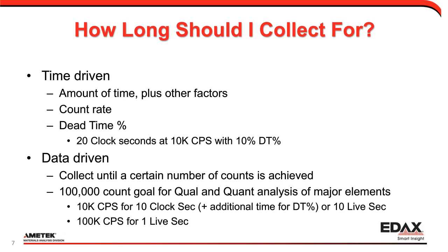One of the activities that we do in applications very frequently is work with customers for training. And one of the most common questions that I get when I work with customers on training is, how long should I collect my data for? In the previous webinar, we talked about how long we should collect our map data for to ensure the quality. And here I'm going to take a little bit different approach and focus on the spectrum itself.